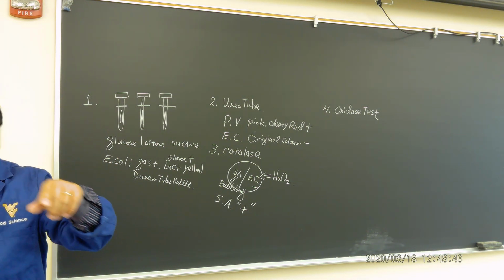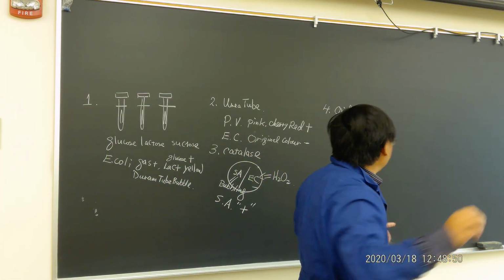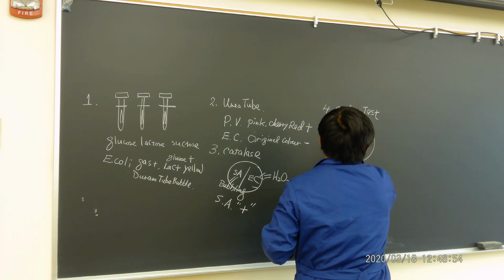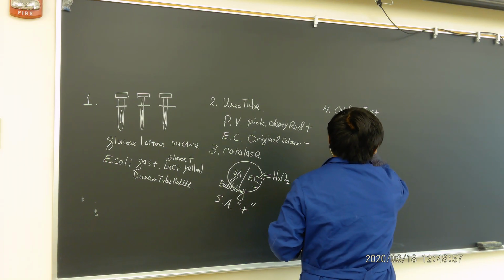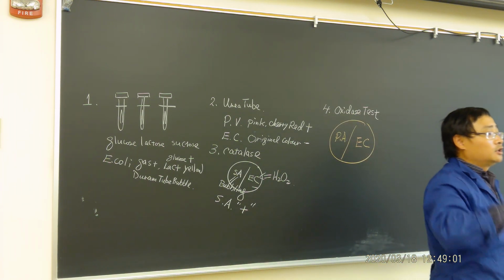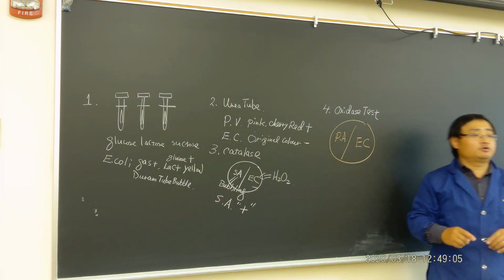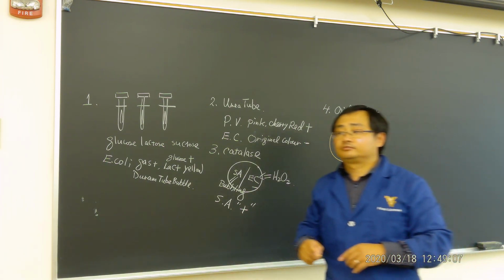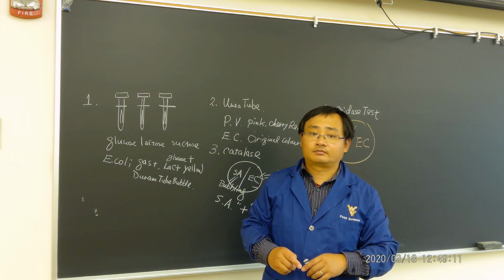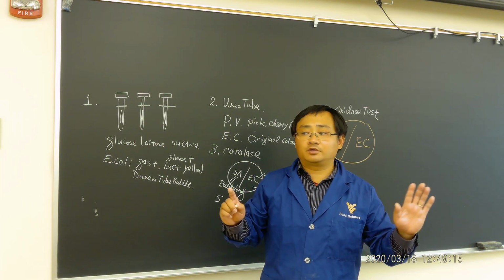Just one drop. So you're going to have the place ready, which is Pseudomonas and E. coli. So Pseudomonas aeruginosa, which is the PA side, and E. coli. We're just going to add a couple of drops there. 2 of you share one place. You can share with your batch partner. Then you can see which side is which. Just 1 drop each side. Very quick, just one drop each side.